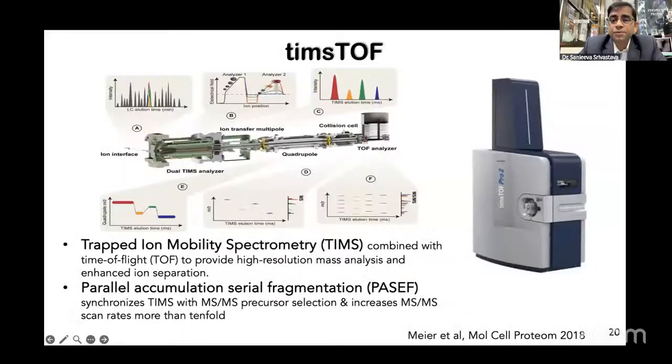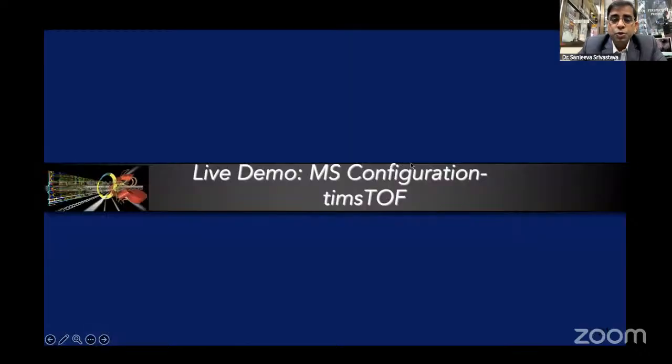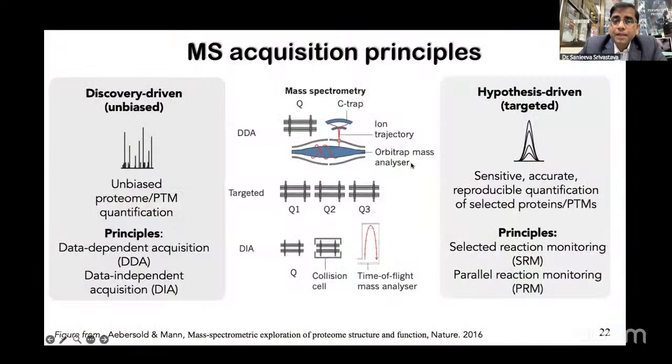Arge, for a wonderful demonstration of our new setup, which I think will motivate all the participants to see a very balanced perspective of different mass spectrometers which we are able to show them. So now broadly, I will continue. Now you have seen different types of nuts and bolts of mass specs, right? Think about the quadrupole, the Orbitrap, the ion trap, the TIMS, various types of analyzers. They can be put together for different applications, right?